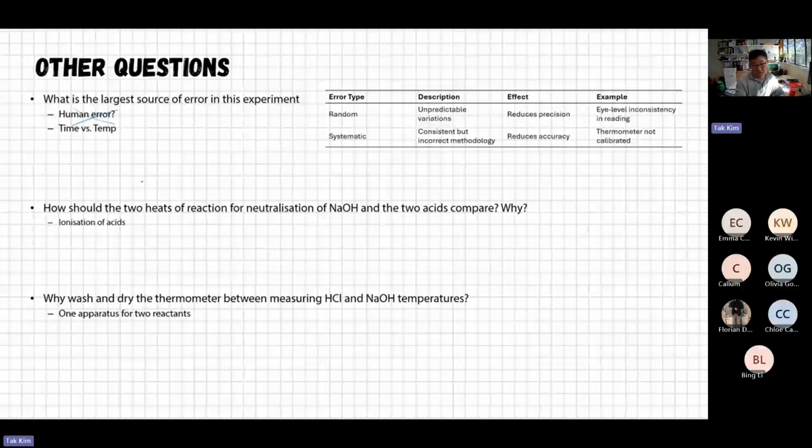As I mentioned in the beginning, temperature was going down, right? Regardless of how it looks. I am saying this more than twice or 3 times. When it comes to measuring changes in enthalpy or measuring energy, it needs to be isolated from the system. But if you see temperature going down, your system was not actually providing good isolation. So that should be the largest source of error.